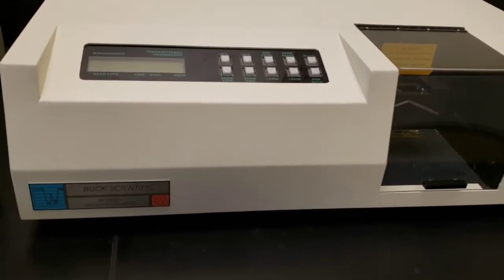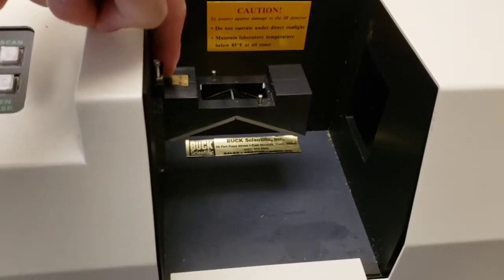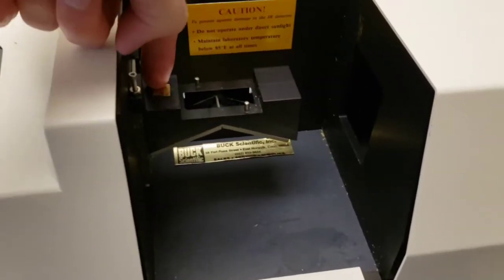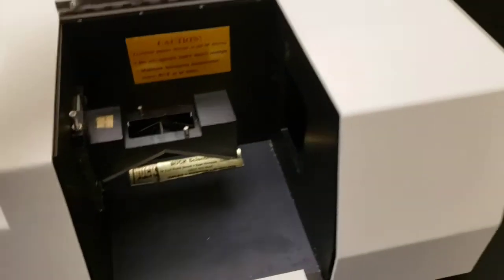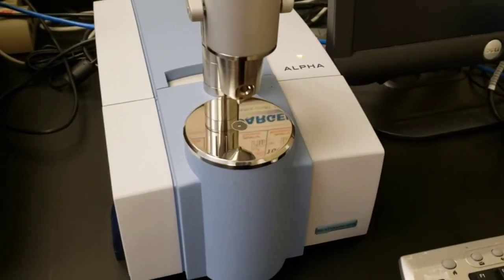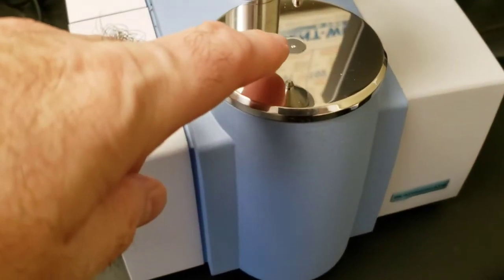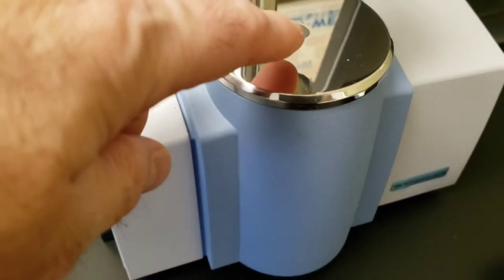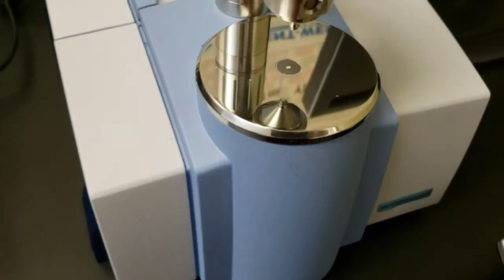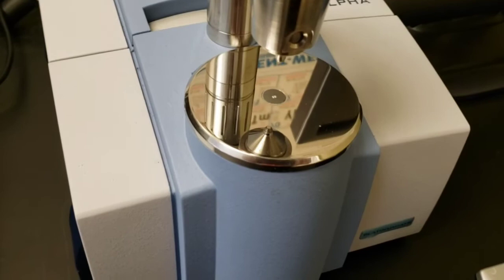This is an infrared spectrophotometer. Samples are placed in the path of a beam of infrared radiation that passes through the sample. This is a more modern infrared spectrophotometer. In this instrument, a liquid or solution sample is placed on this tiny crystal, and infrared energy is bounced off the underside of the droplet.